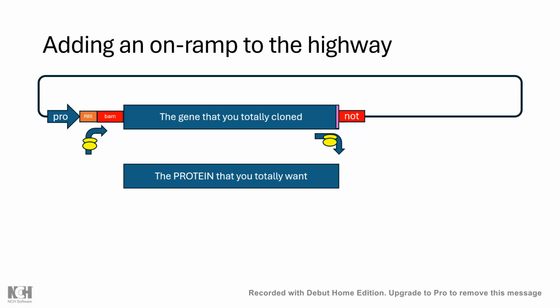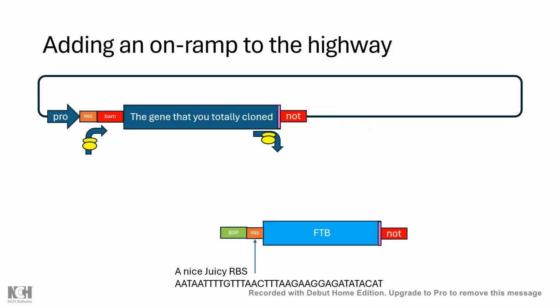Some of them, in fact, refuse to. Let's say it needs something to go with. In this case, it needs FTB, which stands in this case for fluffy teddy bear. Point is, this gene maybe doesn't want to play on its own. You need to co-express. And before you say anything, yes, you could clone it into a separate plasmid, have a different resistance cassette, a different origin of replication, and do it that way. But what if these guys never want to be apart, like ever, ever, ever?